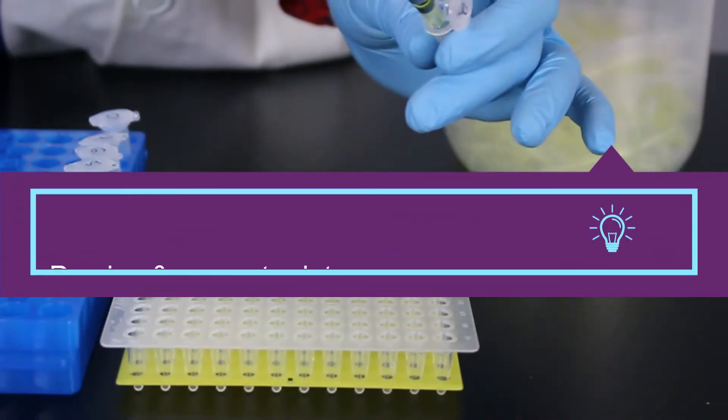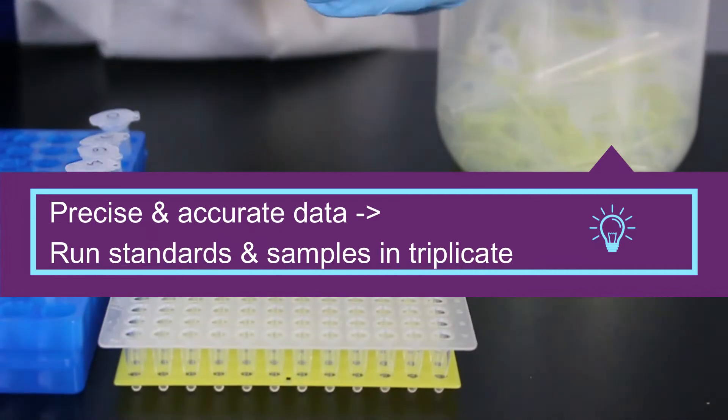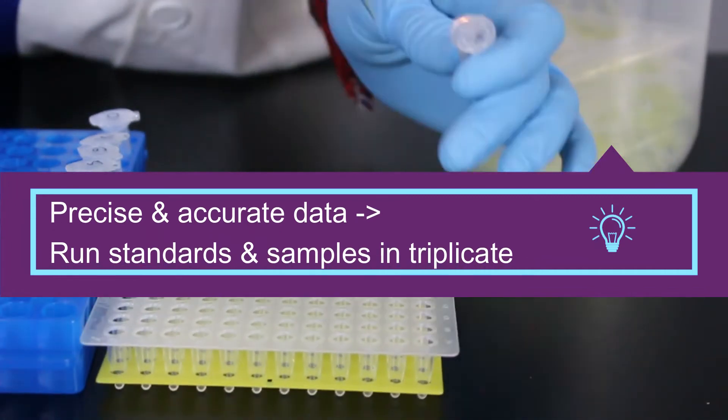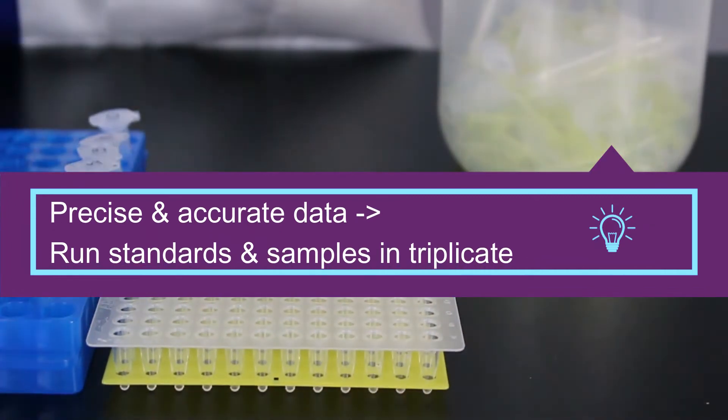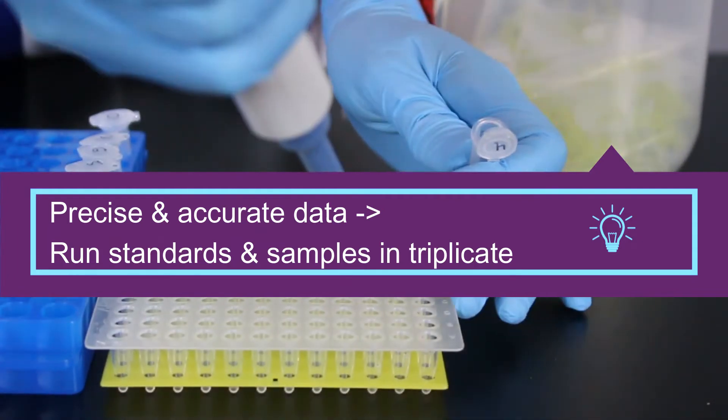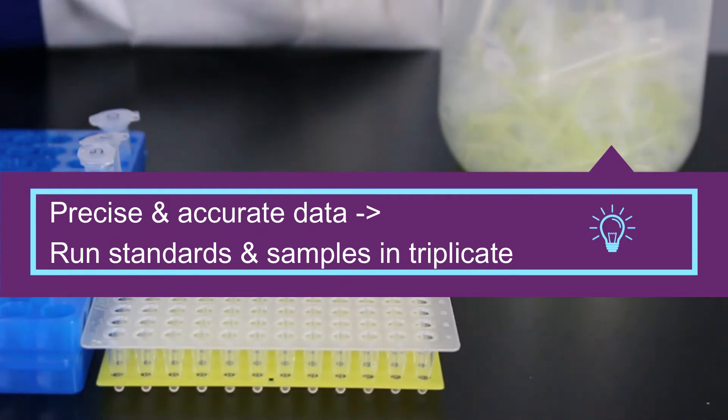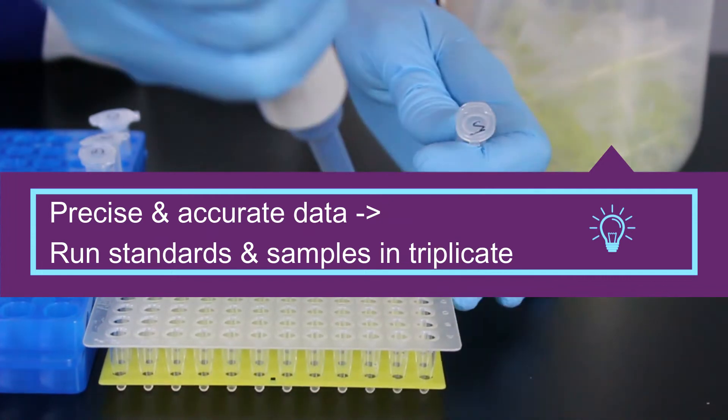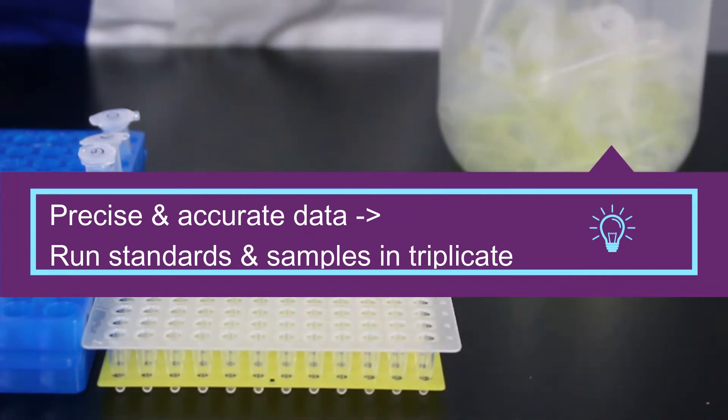The IQ ELISA recommends running standards and samples in triplicate for precise and accurate measurements. Pay attention to your standard deviations as this is traditionally a measure of user precision. We like our technicians to be well under standard deviation of one for each measurement.